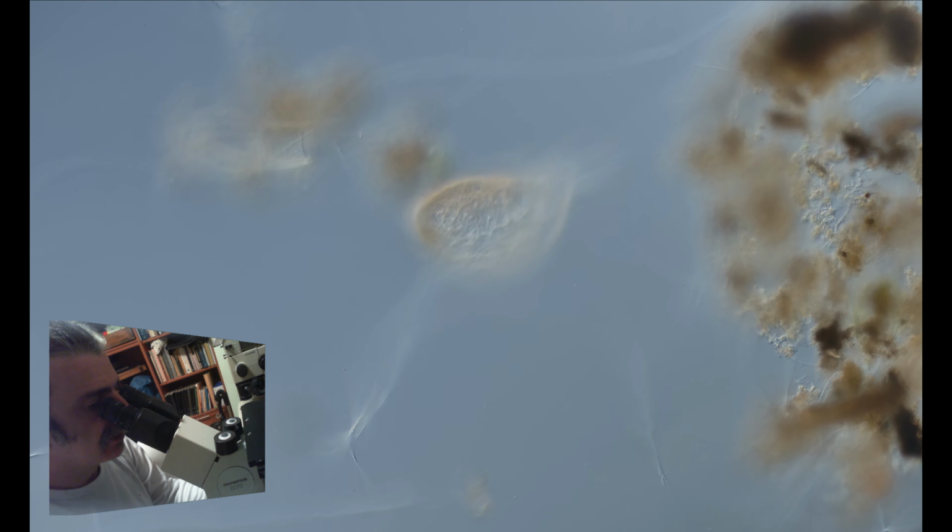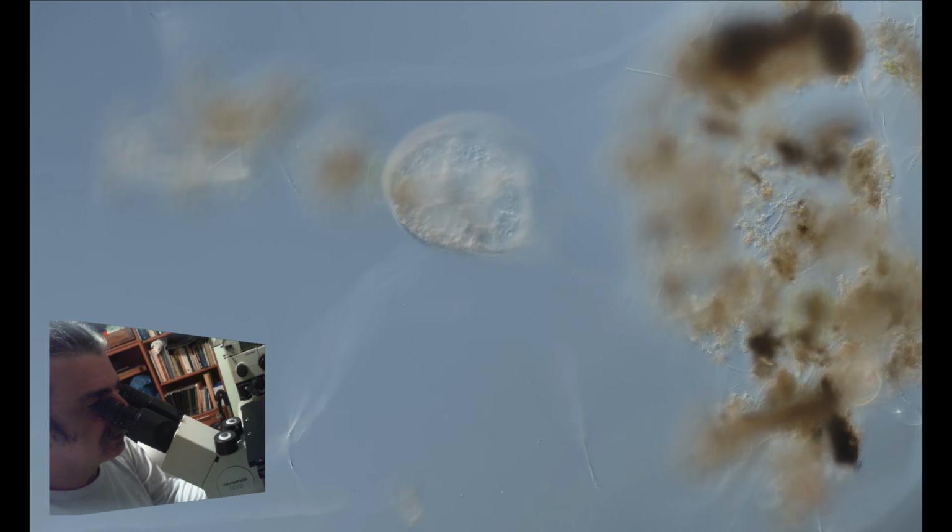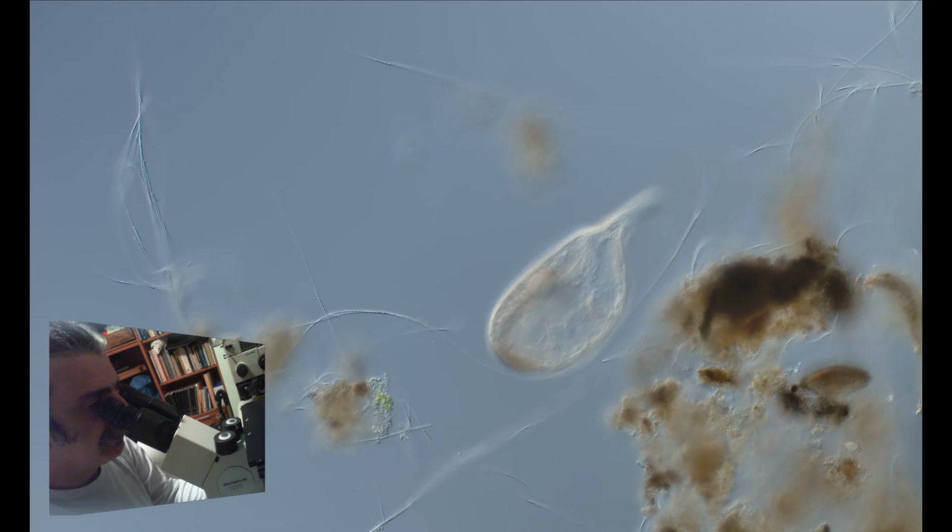Here is again the Trachelius, a magnificent predatory ciliate, like a big balloon. Oh, here is a nice one. Go to the 40 to see that one, and this one is an amoeba.